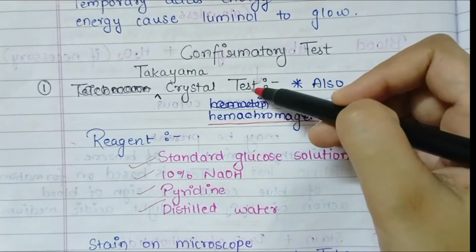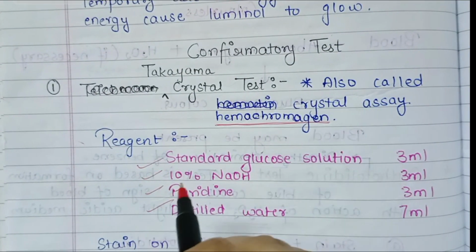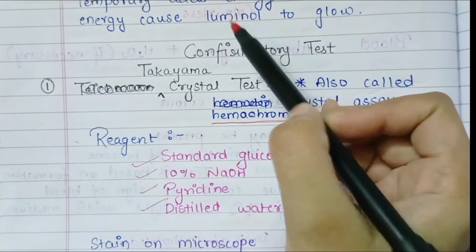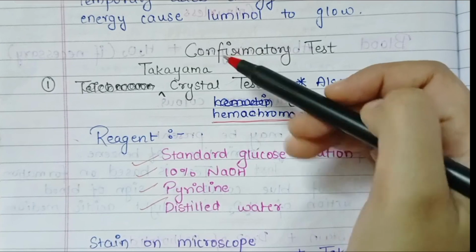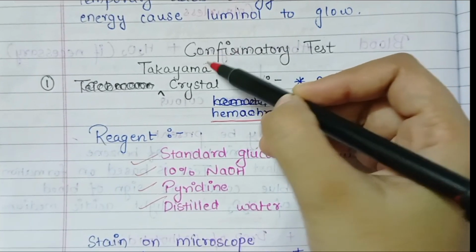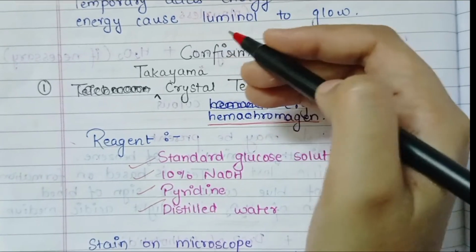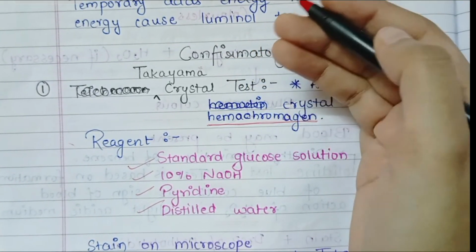The Takayama crystal test, commonly termed the hemochromogen crystal test or hemochromogen crystal assay, is a kind of confirmatory test. To differentiate between a confirmatory and a presumptive test: a presumptive test is done in order to reduce the sample size in case of anonymity of the sample obtained at the scene of crime.